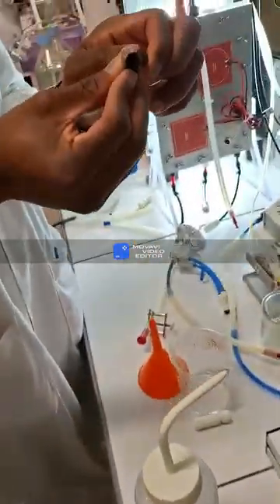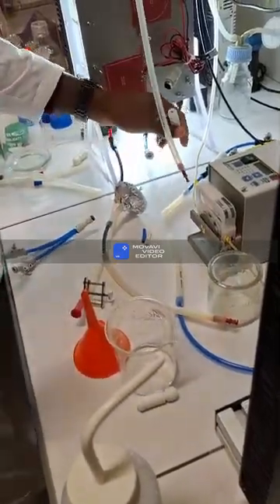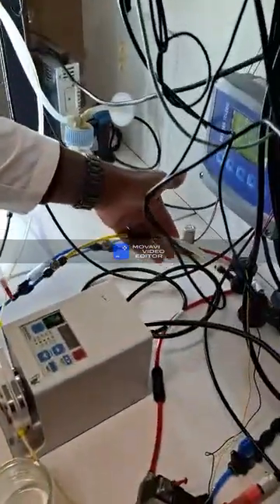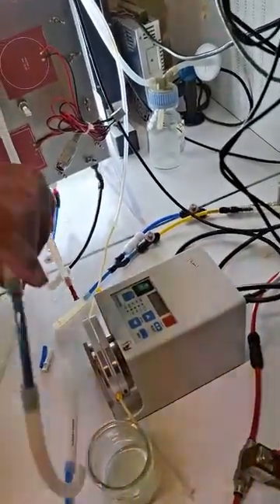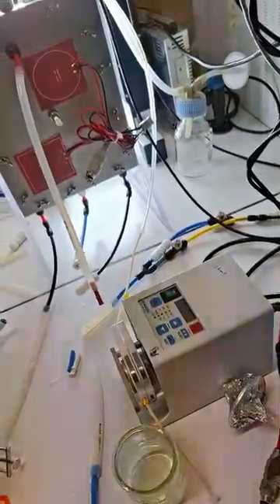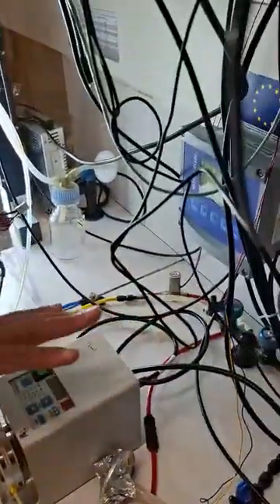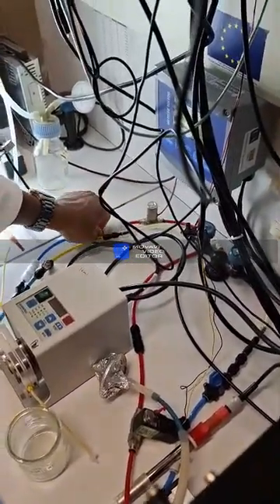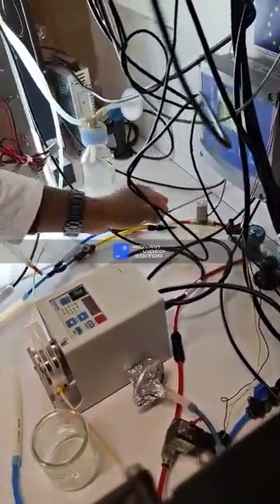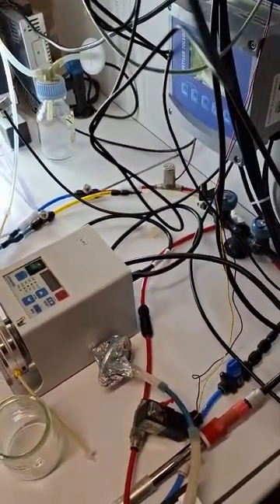T connection, and the goal is to connect the three with the same air injection. So this is why we can separate which one is carbon dioxide and which is air. Normally, it's not always respected, but normally in red it's the carbonic gas, and in blue the color is air.